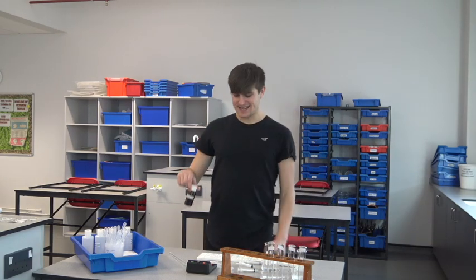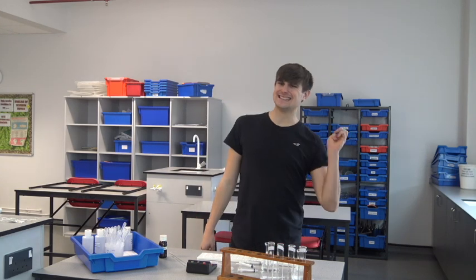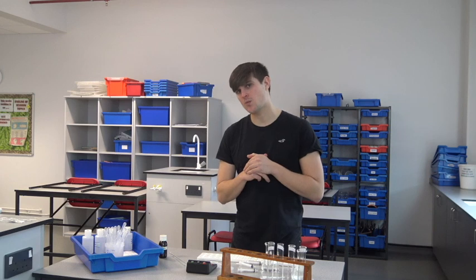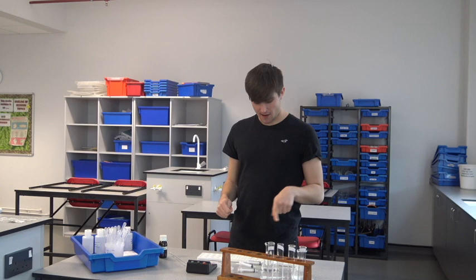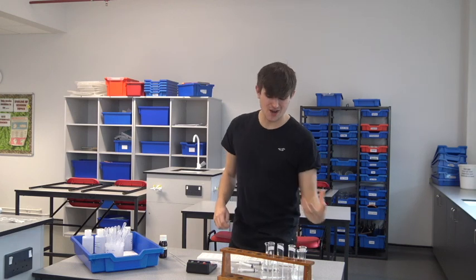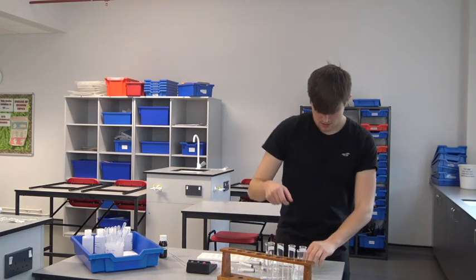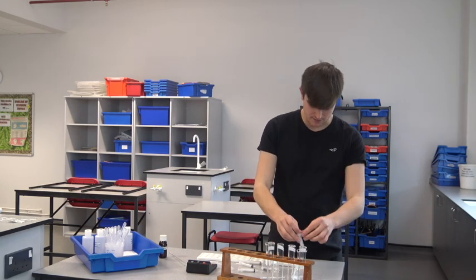Iodine is now in each one of the spotting tiles. My next step is to make the solutions, and I have to make them one at a time. Because what I'm going to do is every 10 seconds I'm going to add some of my solution to the spotting tile, so I can only really do one at a time.